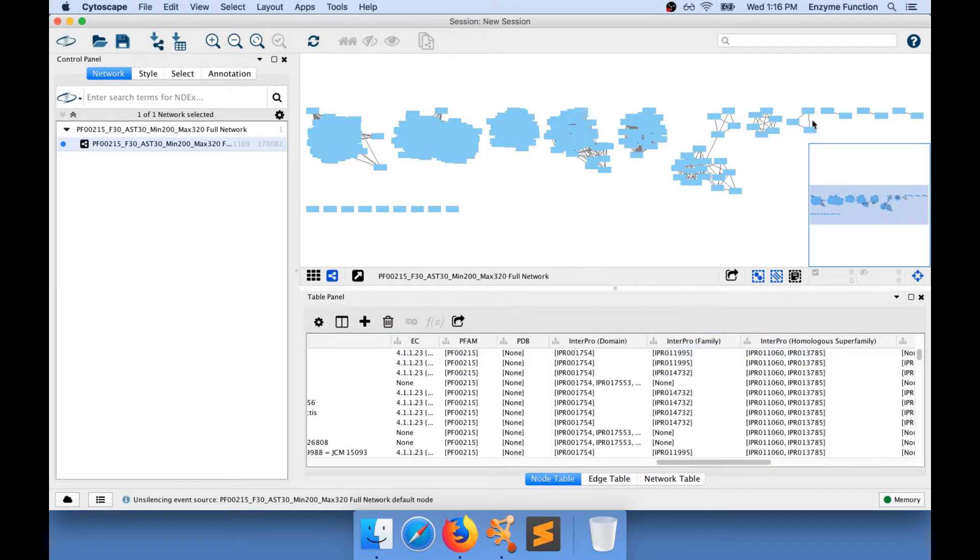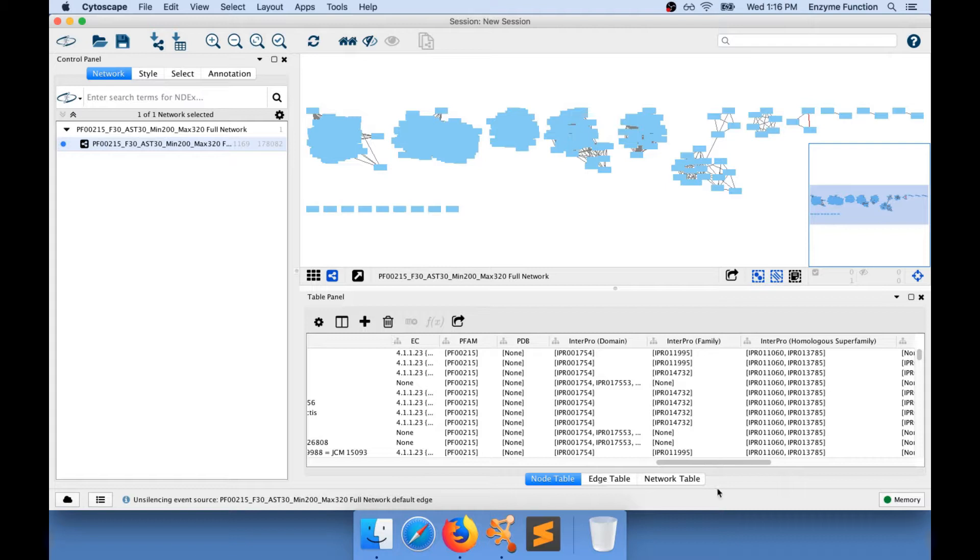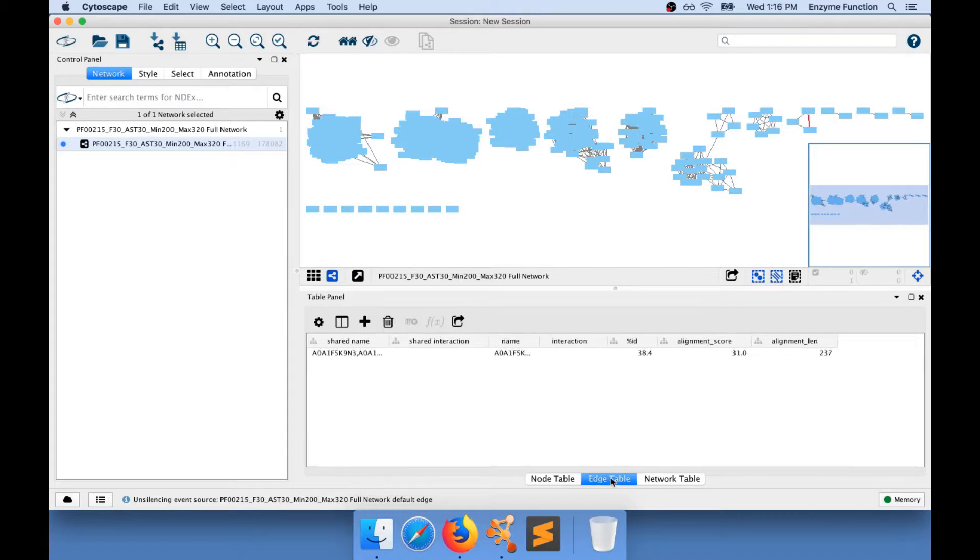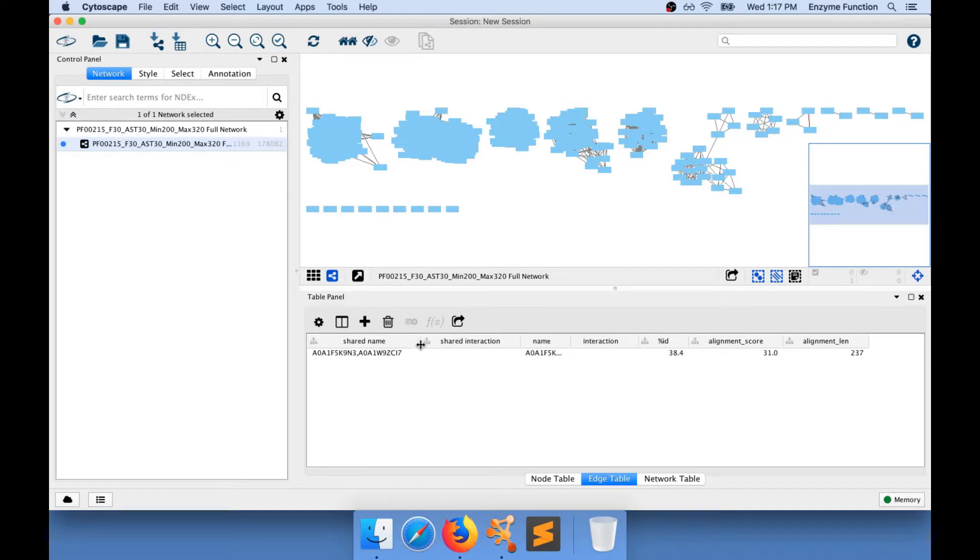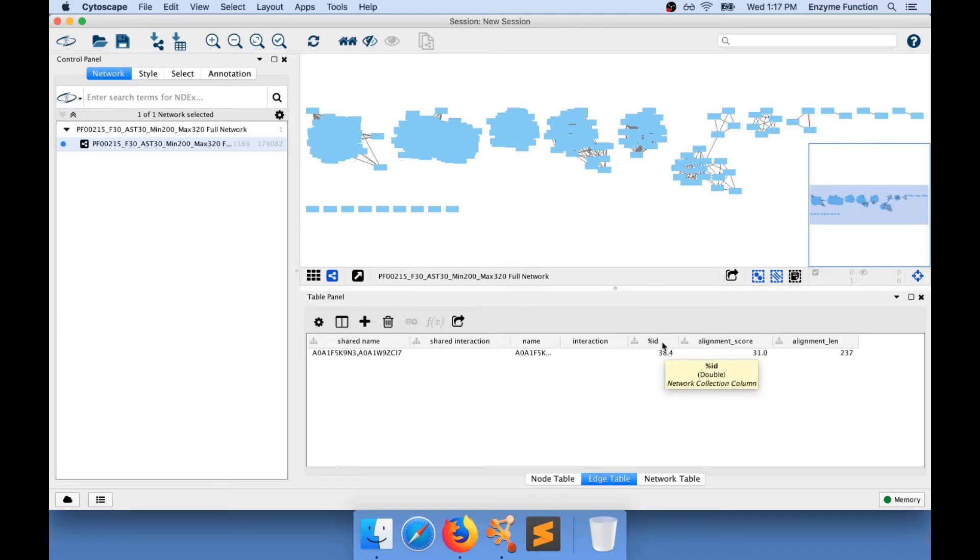Similarly, if you click on an edge, you will be able to select it, and if you go to the edge table in the panel, you will have the information for that particular node. For example, I know that this edge is connecting these two nodes, and that the percent ID between these two nodes is 38.4.